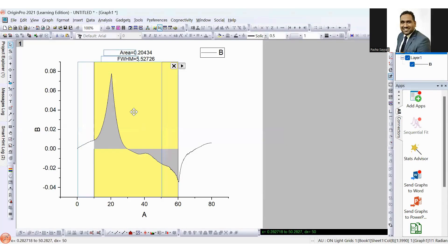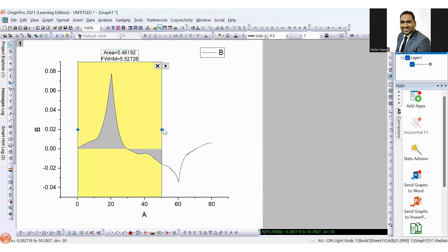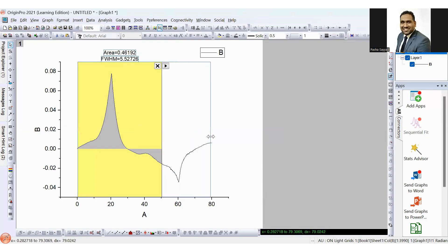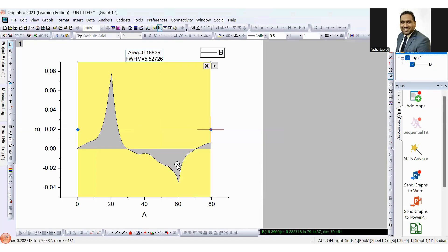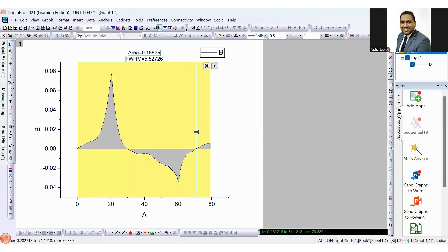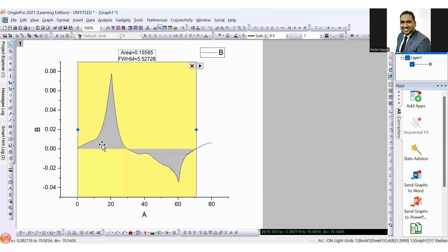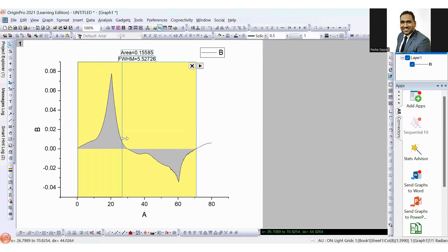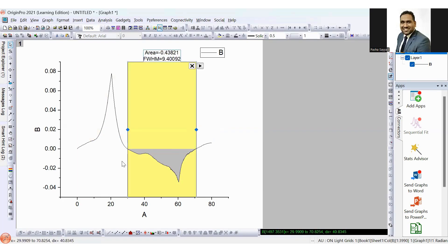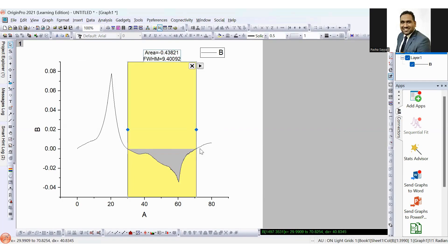And in this way, we can find out area under the curve during both oxidation process and reduction process. You can calculate the total area as well. But in my case, I am calculating area under the curve during the reduction process. So this is your area under the curve calculated using Origin software.